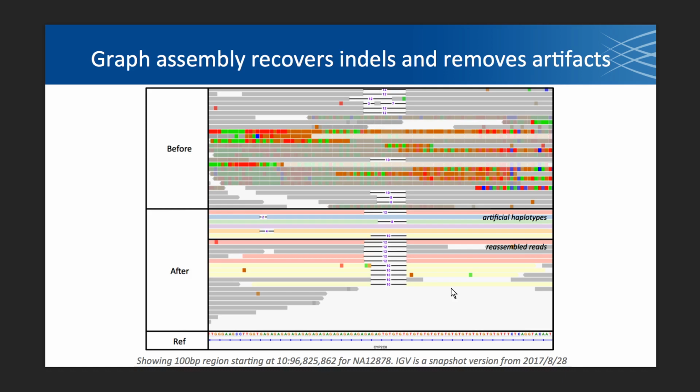what was going on, we're able to see that at this position there are 2 different deletion calls. But they're in pretty good allele balance because we see about 50% for one, 50% for the other. And we see actually 2 different lengths for those deletions.